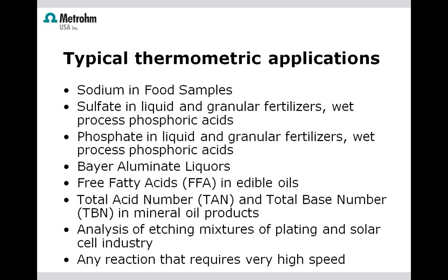And finally, any reaction that requires very high-speed stirring, or you know that the reactions are fast, those are typical candidates for thermometric titration. And also if you're operating within a very difficult matrix, and potentiometric titration has been shown to be not well suited for those titrations, then thermometric titration presents an opportunity in those cases.